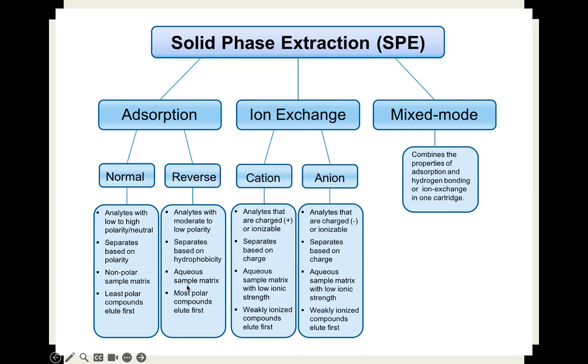Okay. So the types of solid phase adsorbent that you can use, for example, for reverse, for normal, for cation, for ion exchange, you can look at the examples in, I think I have given you this site, LibreTexts, where you can refer more on solid phase extraction. I think I have given you on Monday. Yeah. Right. So you have to know which is suitable for your application.